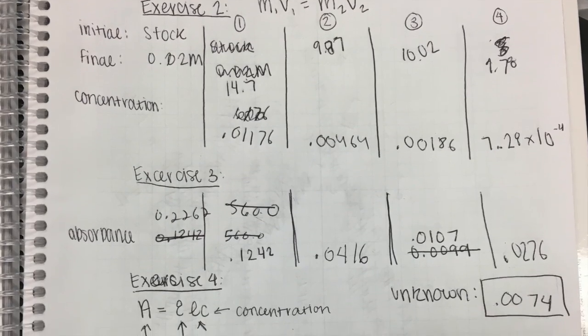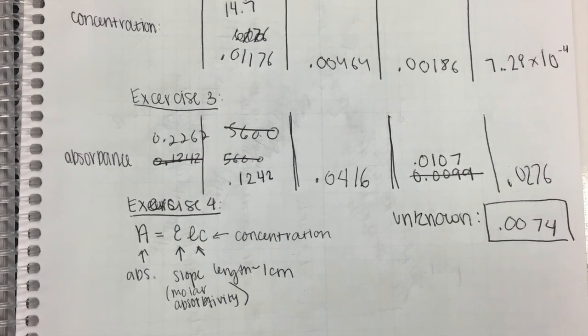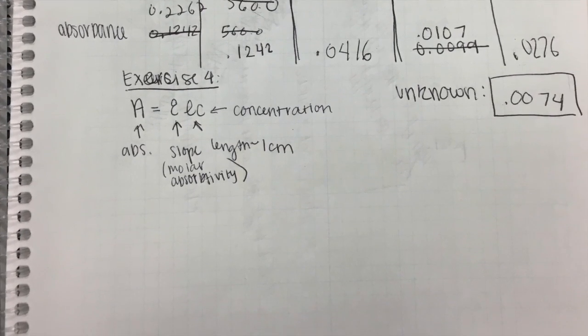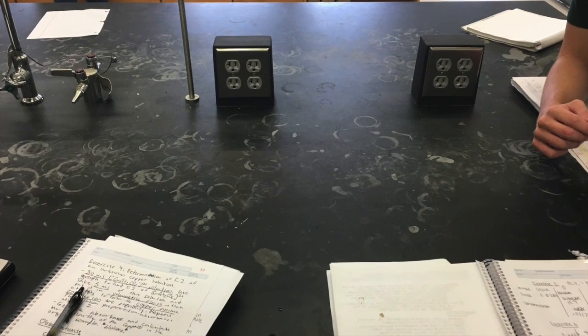Once you are done using the spectrophotometer, use the absorbances you found to do your proper calculations. Finish the lab by cleaning up your workstation.